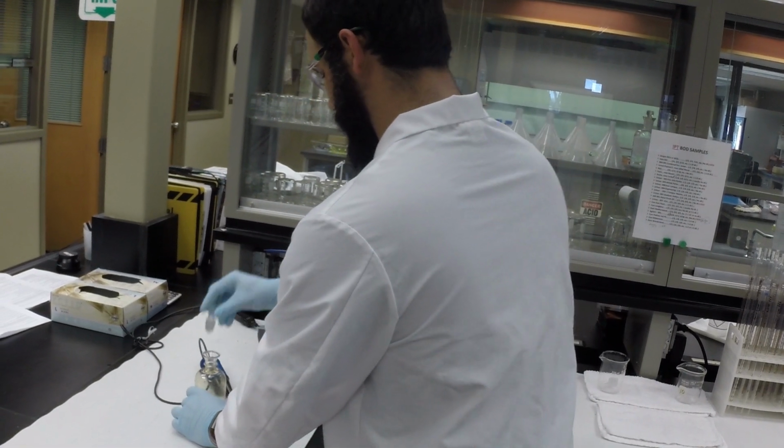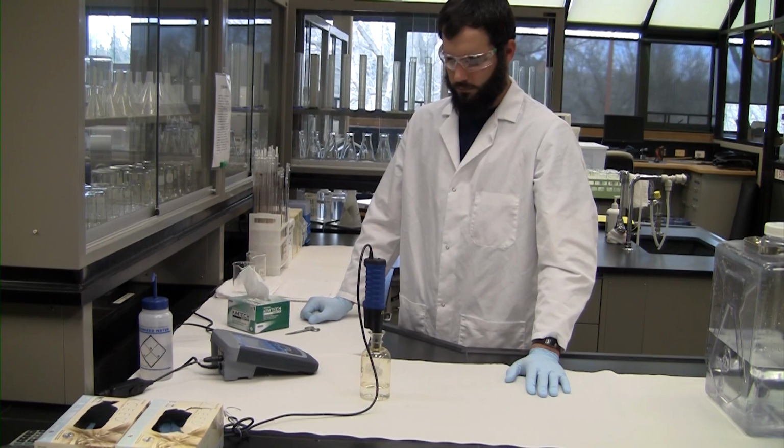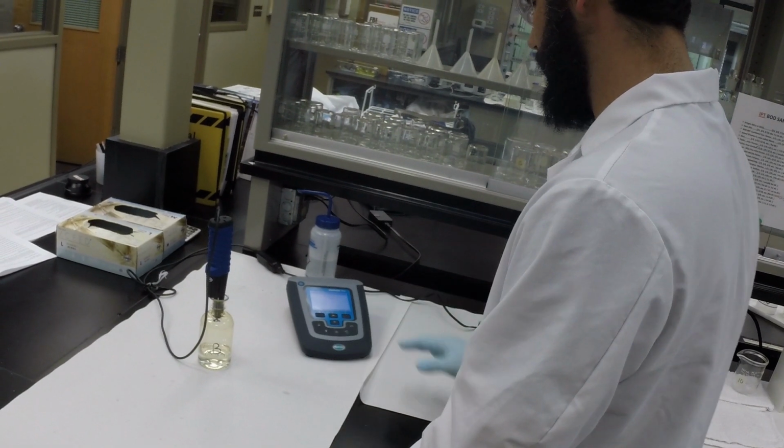Remove the stopper and quickly insert the tip of the probe into the bottle. Make sure that it is a firm and tight fit. Wait 10 minutes and then press calibrate on the meter.